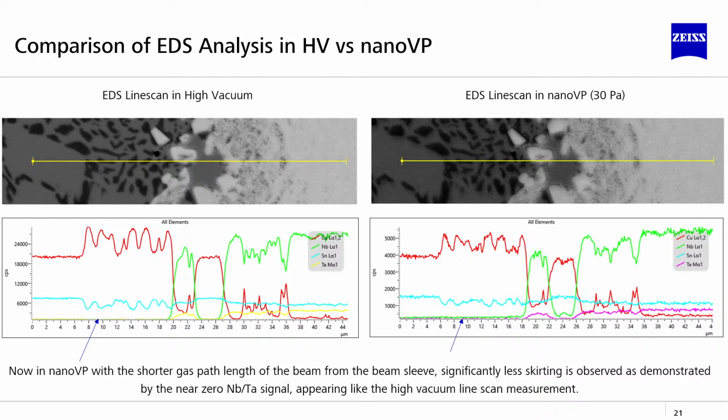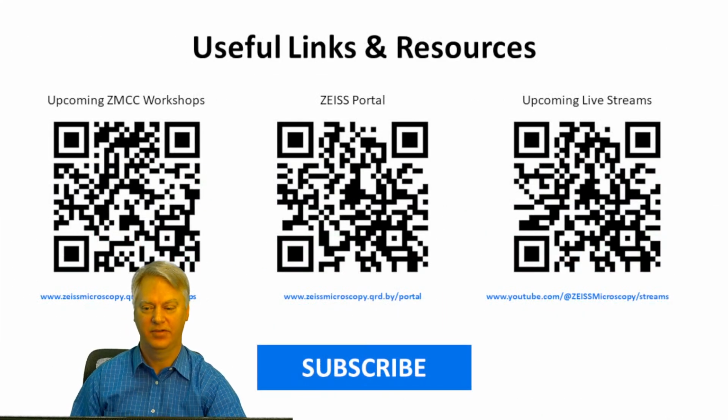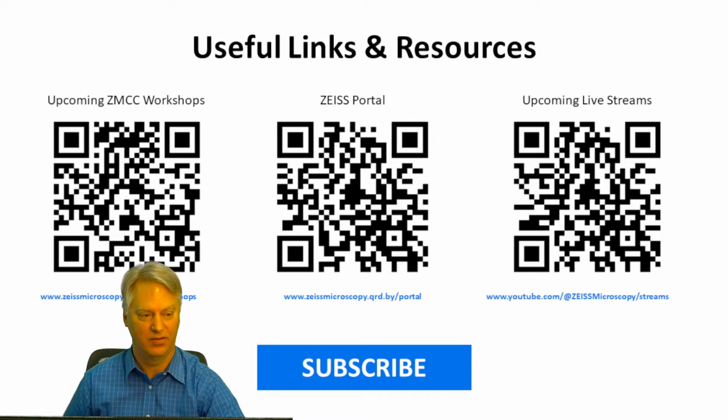I'm going to come back now. So that was it. Hopefully you learned some things that you didn't know about the NanoVP.